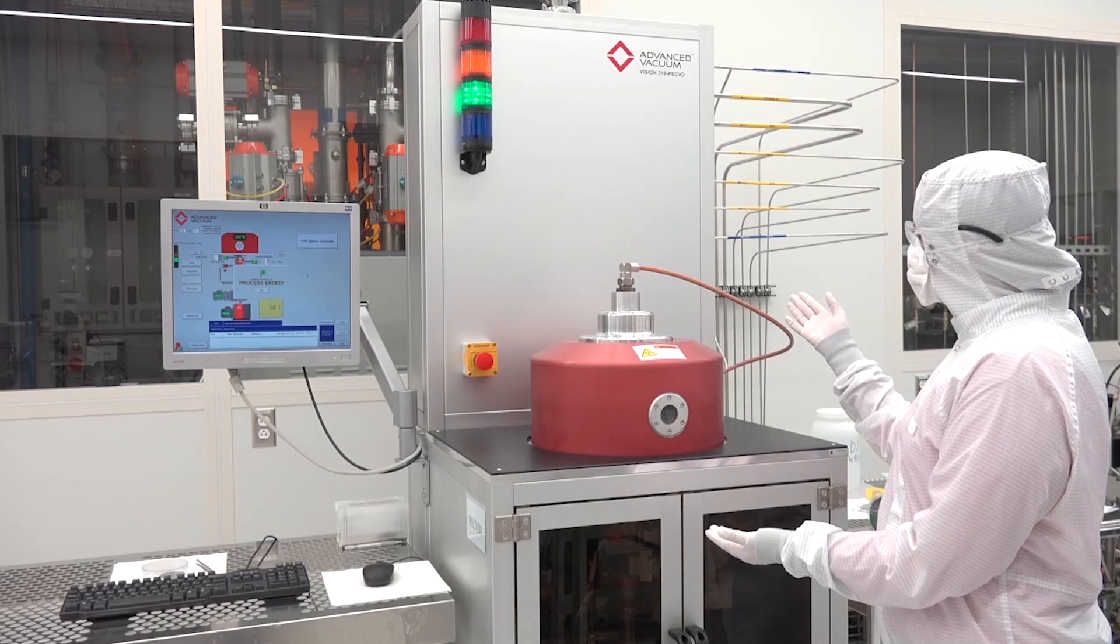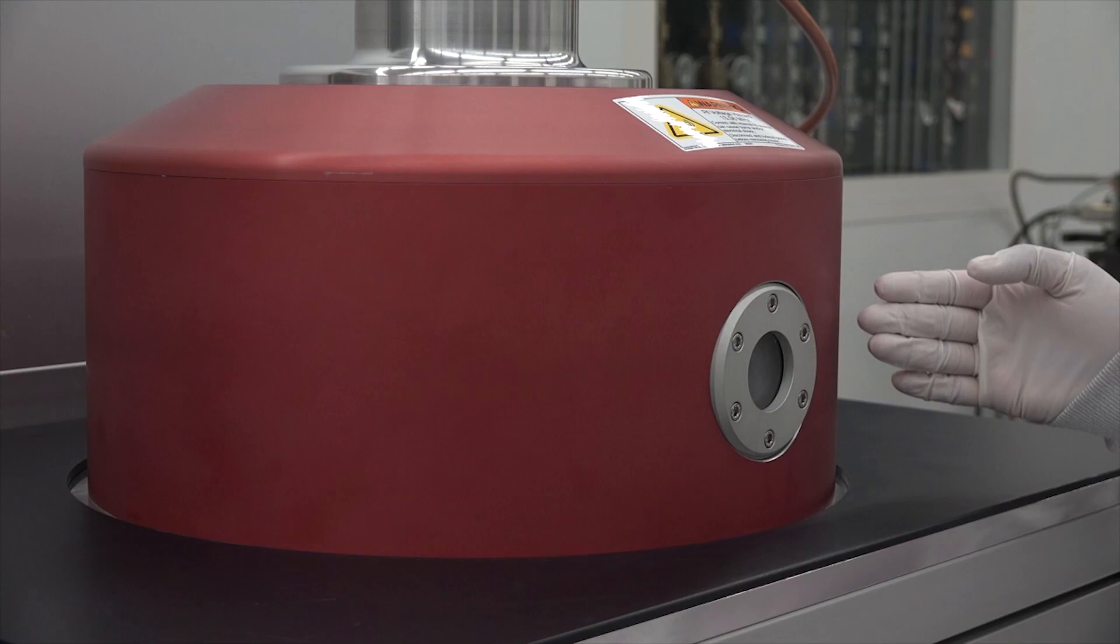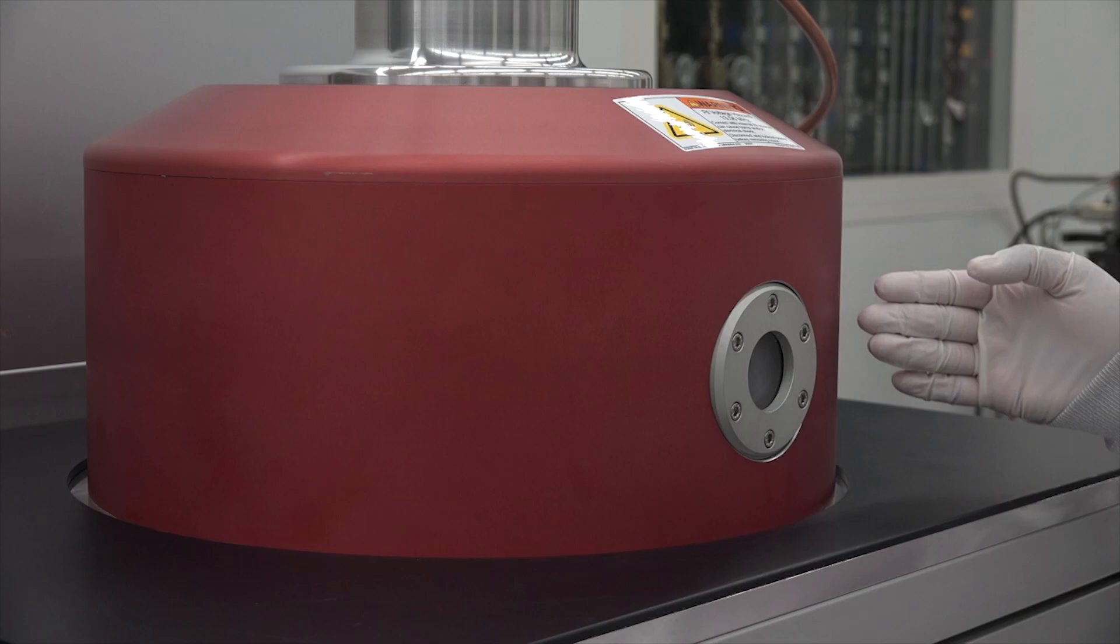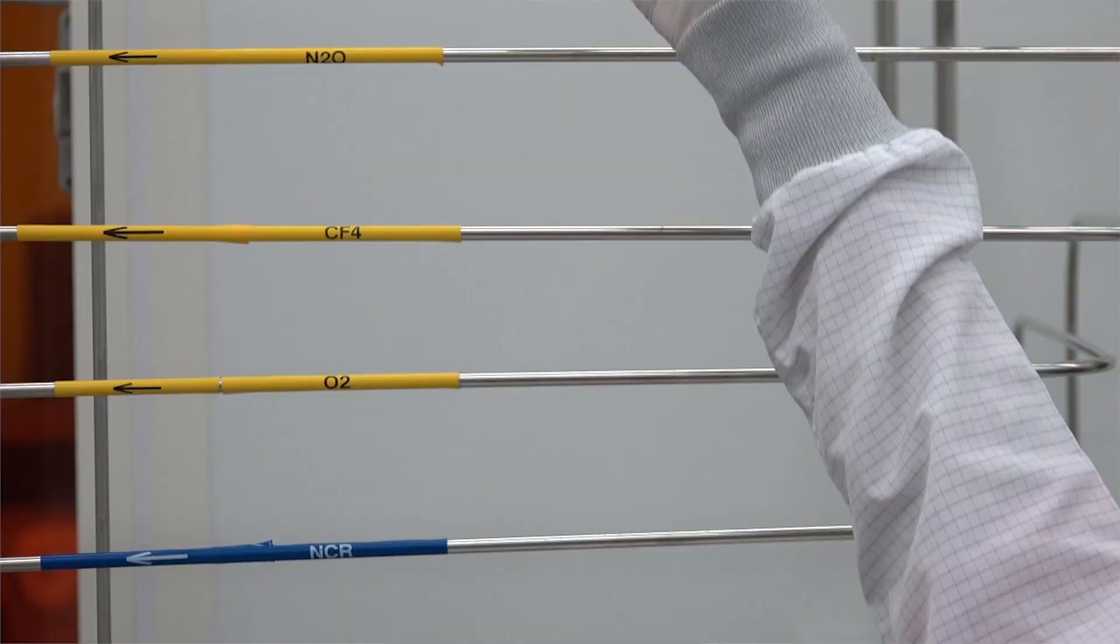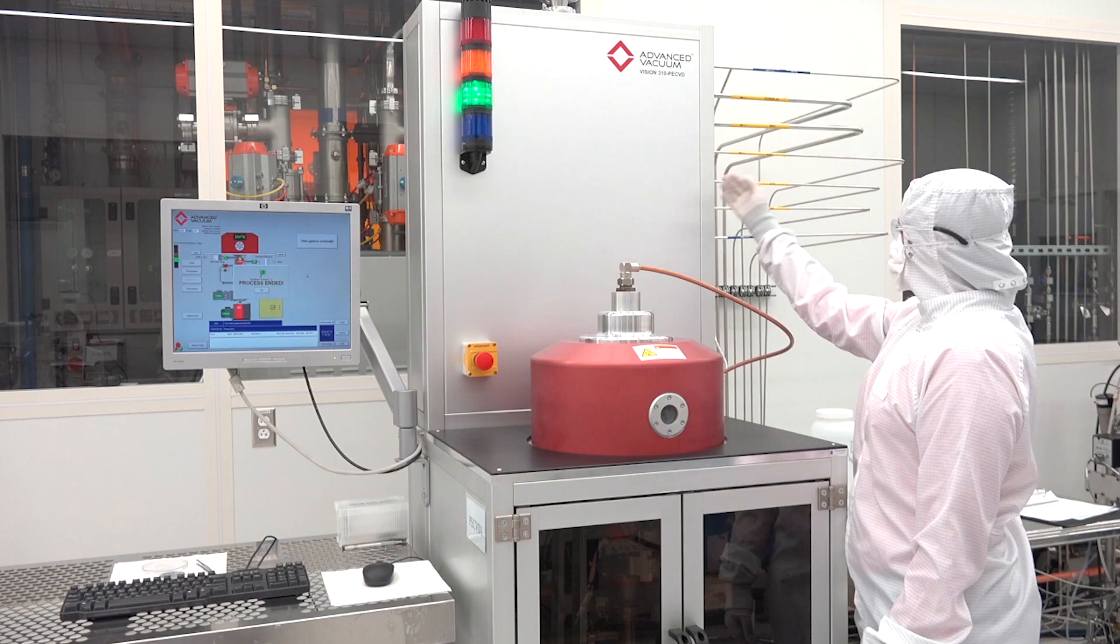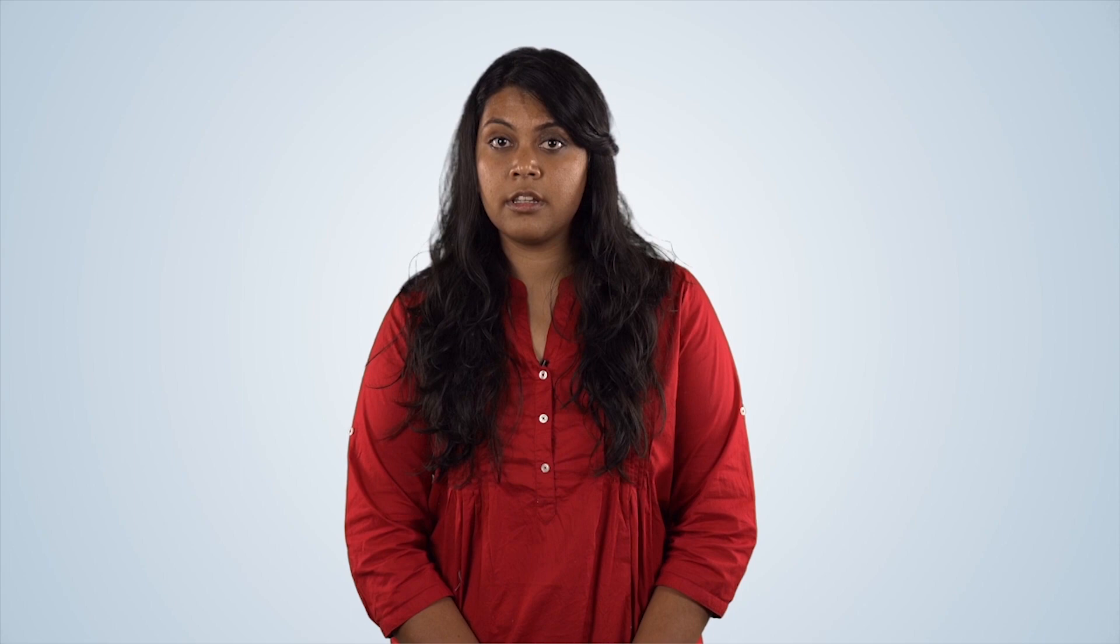This is the PECVD system located within the clean room at Duke University. The red dome is the deposition chamber. This is where the process occurs. On the side of the system, there is stainless steel tubing. These tubes carry the gases to the deposition chamber through the top of the chamber. There are many computer-controlled valves that control the exact flow of these gases. Each material deposited uses specific gases in controlled amounts, which is specified in the recipe for each material. These recipes are stored in the computer.